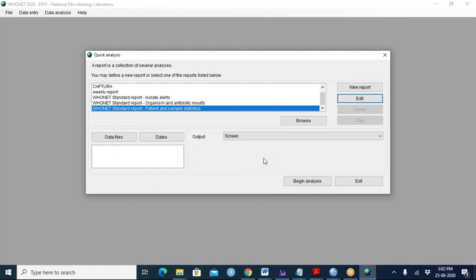Also, I told you to put Capsula, comma, space, PE, comma, space. It also doesn't need the spaces. I like the spaces because it looks nicer. But we try to make it so small details do not matter. It can be upper or lowercase. You can put extra spaces. So if you find any problems, let us know. But these are excellent questions. These are the same questions I would want to know. But no, it is not case sensitive.